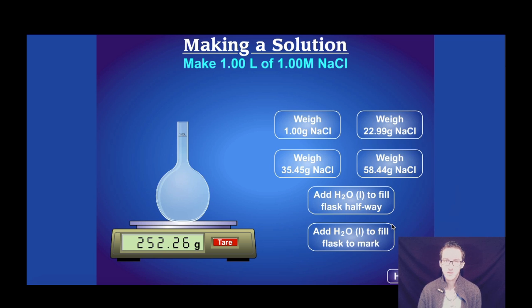Now, the first thing we want to do is recognize that that flask has a mass. So I'm going to tare that mass or zero it out.